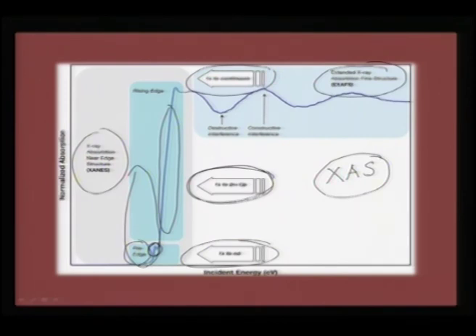So, several of these processes happen, all mapped under the same phenomenon of X-ray absorption spectroscopy. It is not possible in one single lecture to cover the whole spectrum of manifestations of this spectroscopy. So, I would like to talk about different things that can happen in this edge. That is why it is called edge spectroscopy, and this edge is attached to the sort of excitations that can happen. It can be called K edge or L or M edge. We will see that in the next slide.